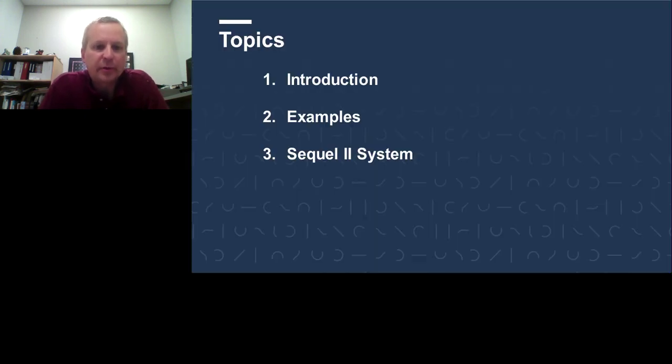My presentation will have three parts. I'll give a brief introduction, followed by examples of how PacBio technology can be used towards advancing the goals of precision medicine. And then at the end, as a third topic, I will talk about the new Sequel II system.